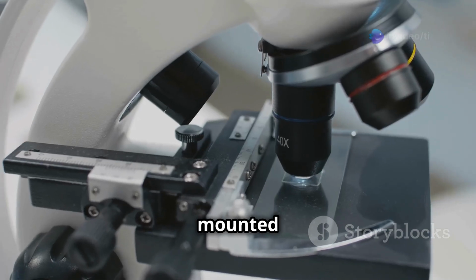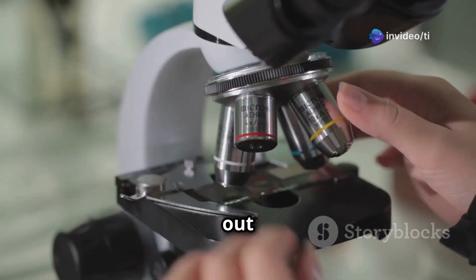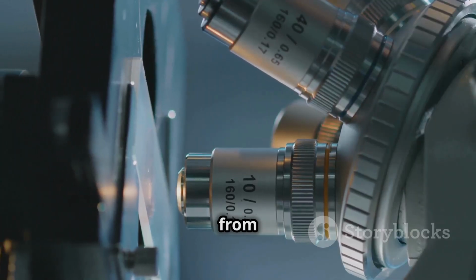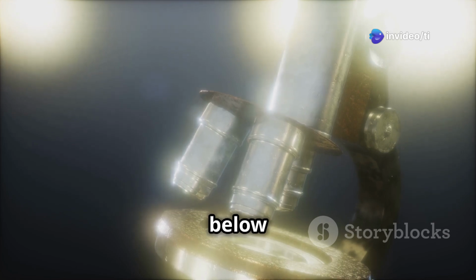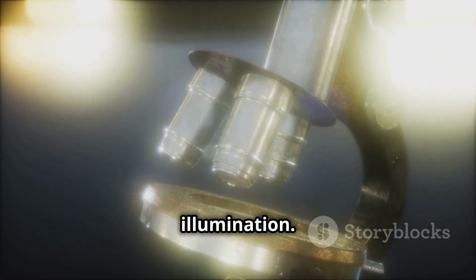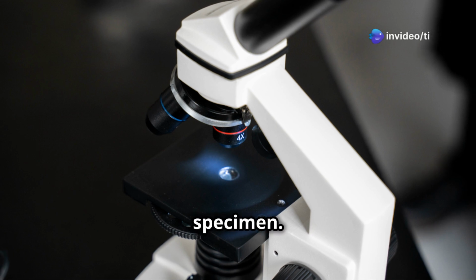Objective lenses, mounted on a rotating nosepiece, provide different magnification levels. You can switch between them to zoom in or out on your specimen. The stage is the platform that holds your specimen securely in place. Clips prevent it from moving around while you're observing. The condenser, located below the stage, focuses light from the source onto the specimen, ensuring optimal illumination. The illuminator is the light source, often a built-in lamp, that provides the light needed to see the specimen.